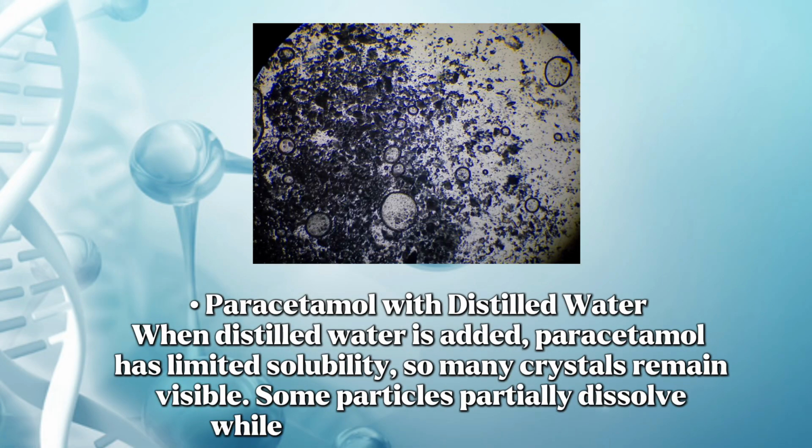Paracetamol with distilled water. When distilled water is added, paracetamol has limited solubility, so many crystals remain visible. Some particles partially dissolve while others remain suspended.